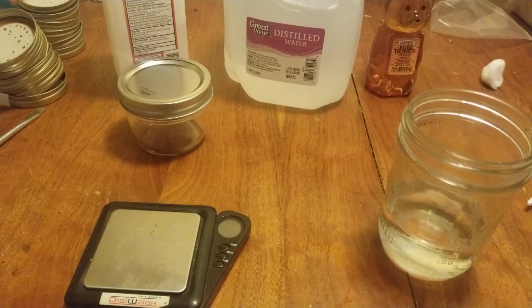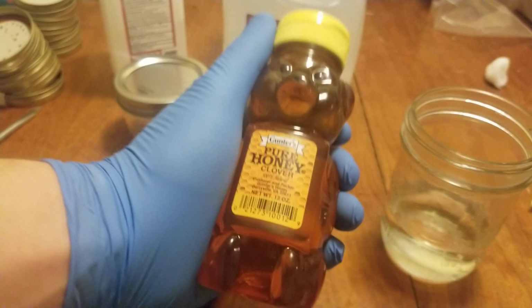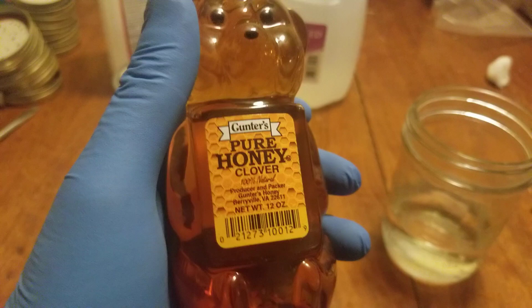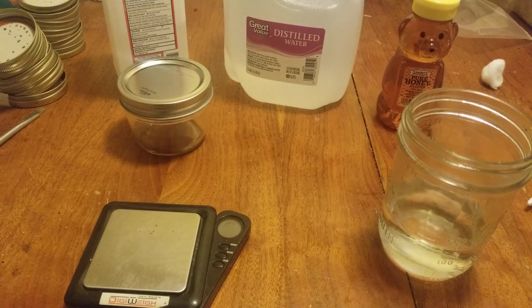And you're going to need some honey or light corn syrup. Yeah, light corn syrup. Sorry, guys, I had to think for a second of what it was called. We're going to be using honey for this method, as that's the only thing I have. I don't have any light corn syrup. Make sure you get light corn syrup, too.